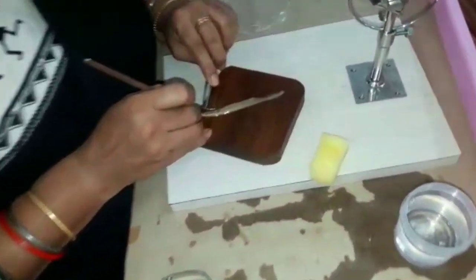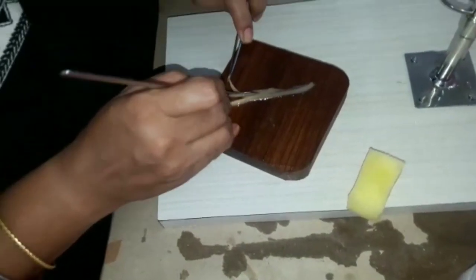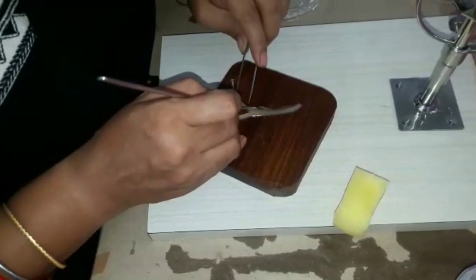Both sides of the mantle are trimmed or cut off to obtain a narrow rectangular ribbon.